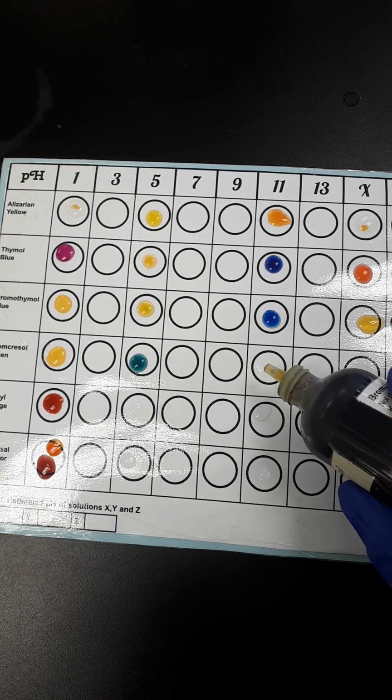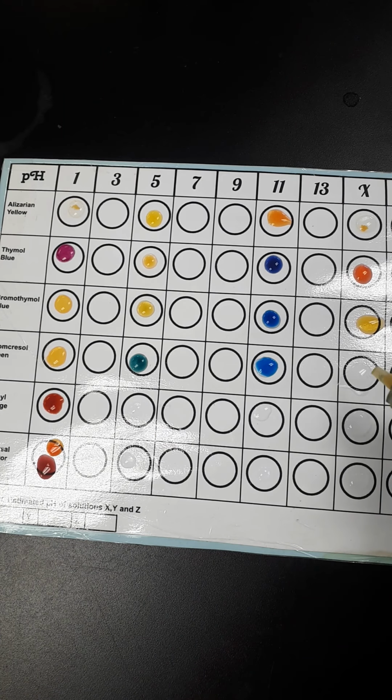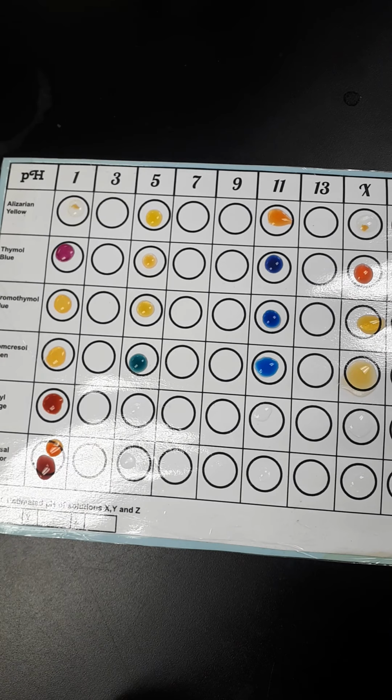Anyways, let's try pH of 11. As predicted, turned blue, and then our unknown should again be yellow. So again, our pH range for this one might kind of stink. I might have chosen a bad one, but that's a pH of, was I using bromocresol green? Less than 3.8. So I've got that summarized on my napkin over here.